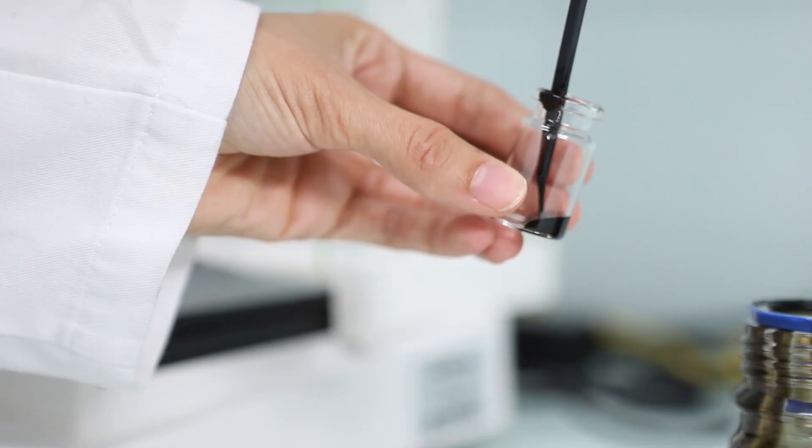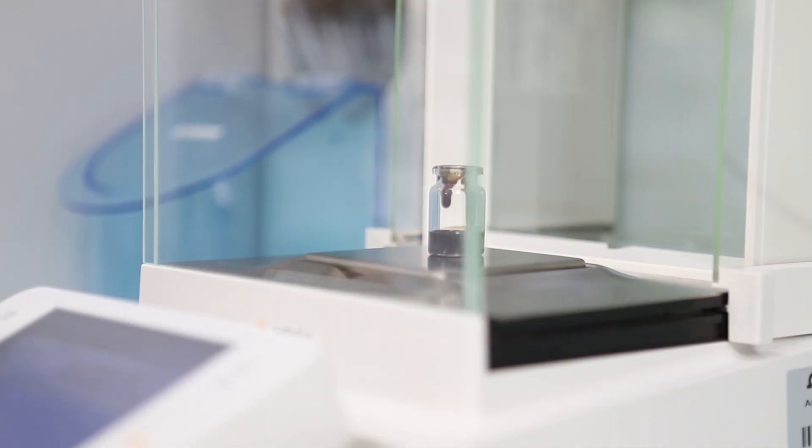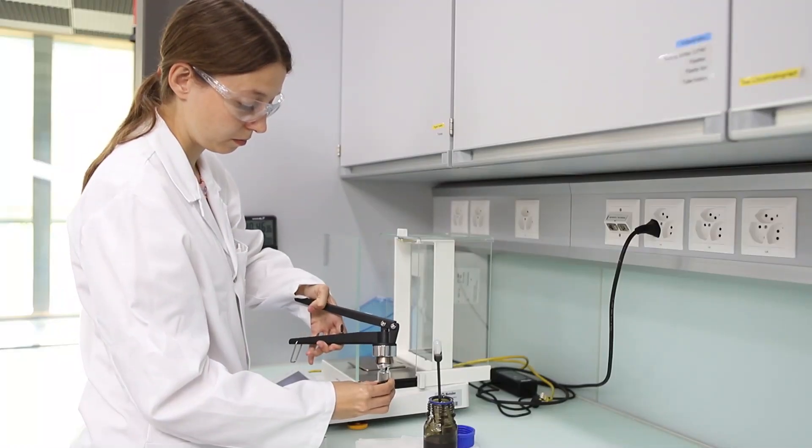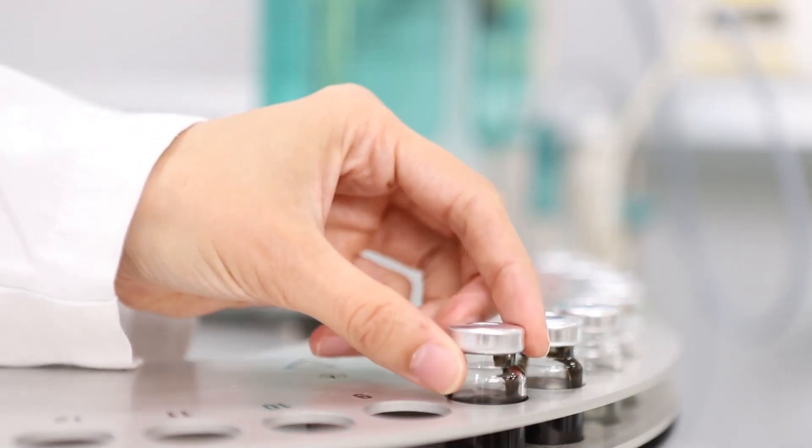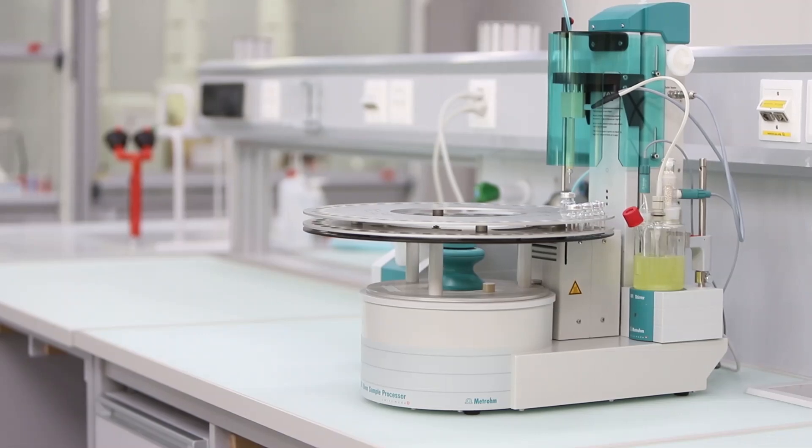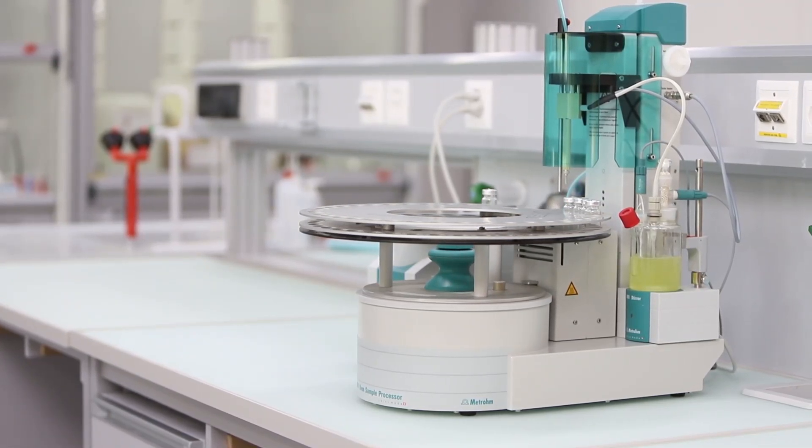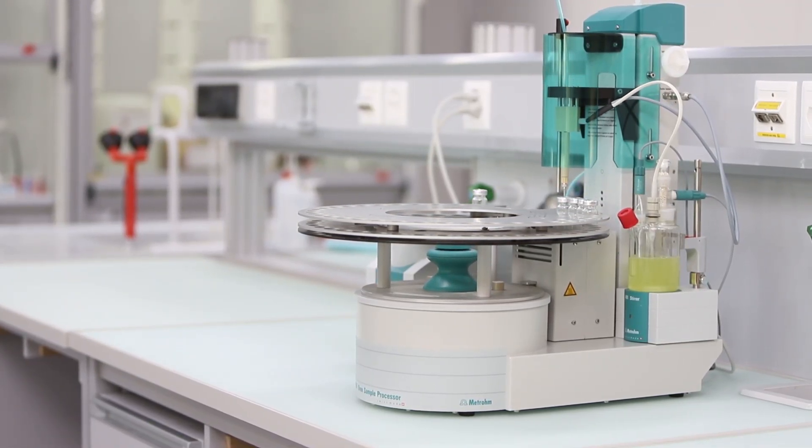The sample is weighed into a single-use vial. The vial is then hermetically sealed. Then it is placed in the Carl Fischer oven, in our case an oven sample processor. This allows us to analyze up to 35 samples fully automatically.